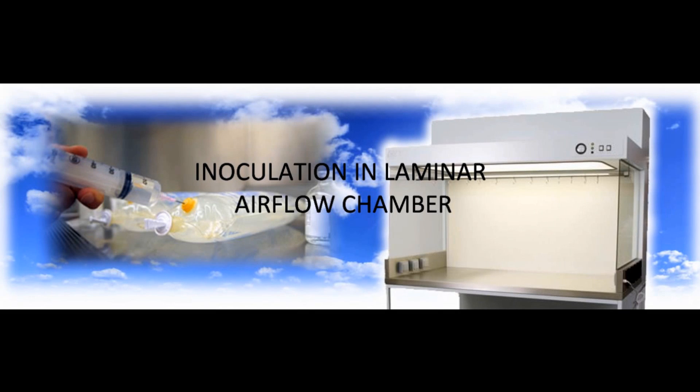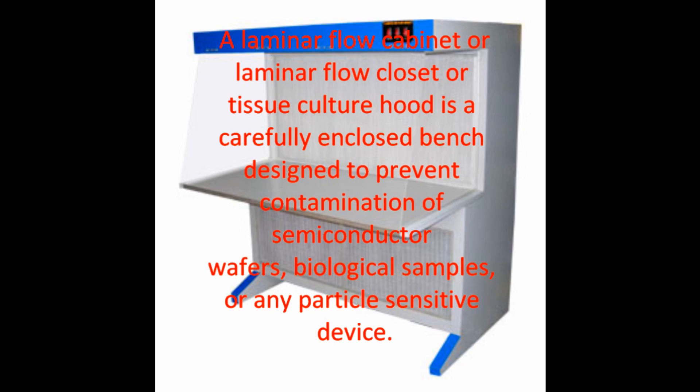Inoculation in Laminar Air Flow Chamber. A laminar airflow cabinet or laminar flow closet or tissue culture hood is a carefully enclosed bench designed to prevent contamination of semiconductor wafers, biological samples, or any particle sensitive device.